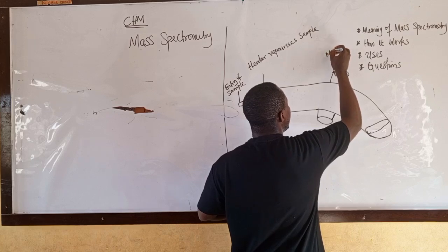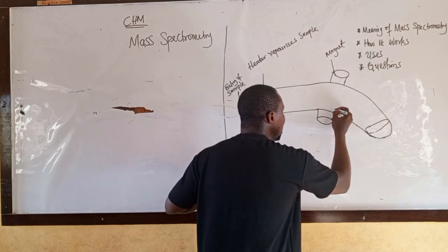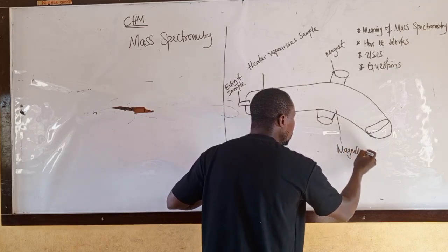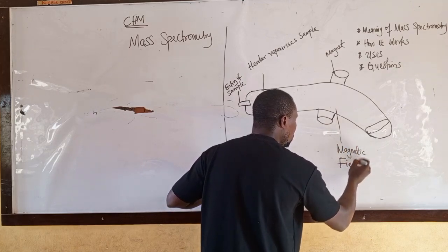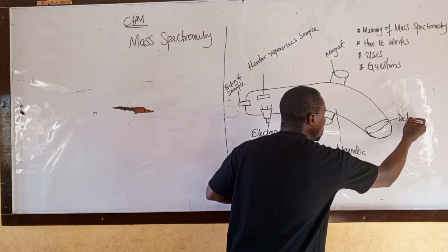Then here we have the magnet. Here there's the magnetic field. Here is the detector.